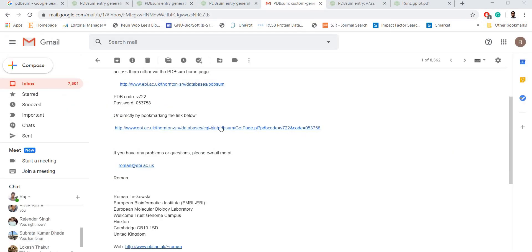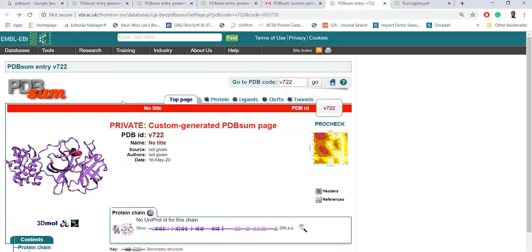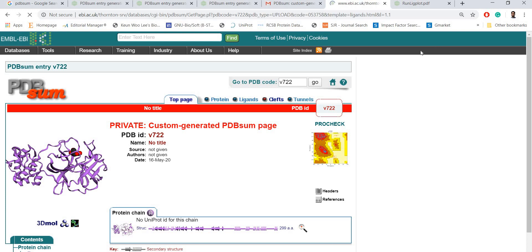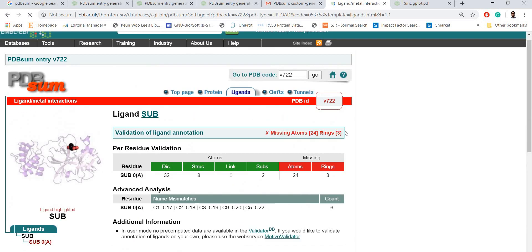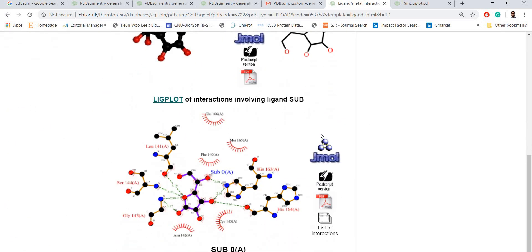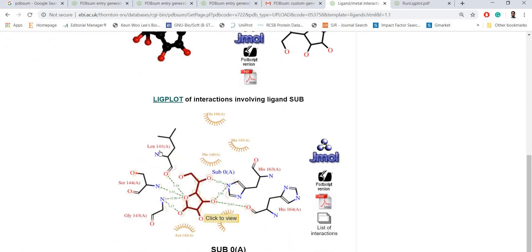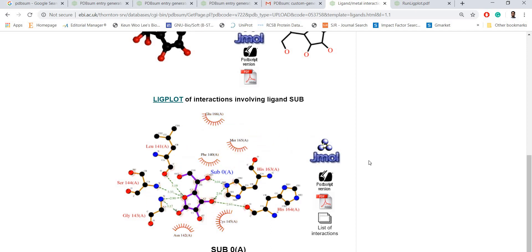You will be guided to this page. Make sure you go to ligands, click ligands, scroll down, and the interaction plot will be given to you in this window. Just go to PDF version.